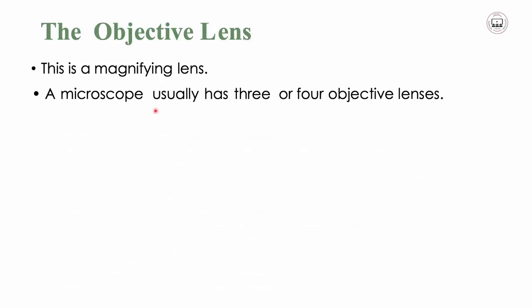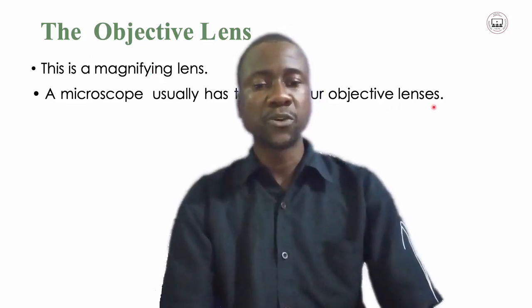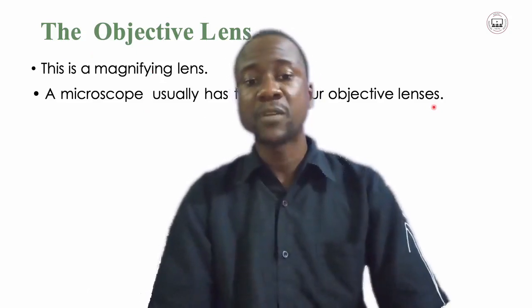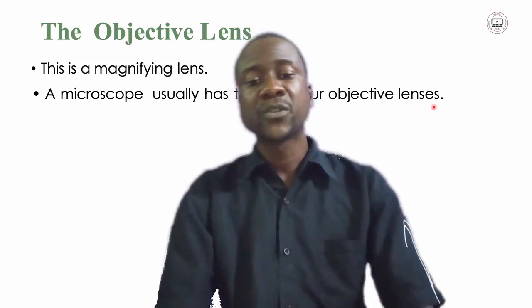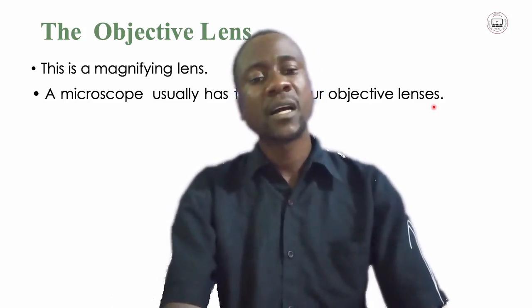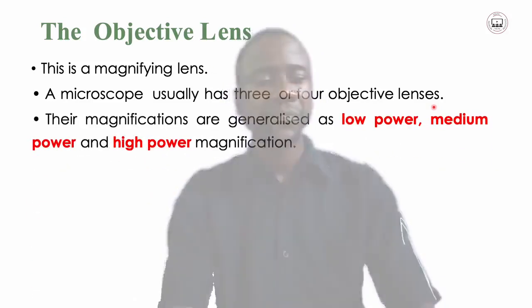Now let us look at the objective lens. This is a magnifying lens. A microscope usually has 3 or 4 objective lenses. If you may recall from the video, I hope they happened to show you that the microscope had 4 objective lenses. So those are the lenses you may use as you are looking for tiny objects on the microscope.